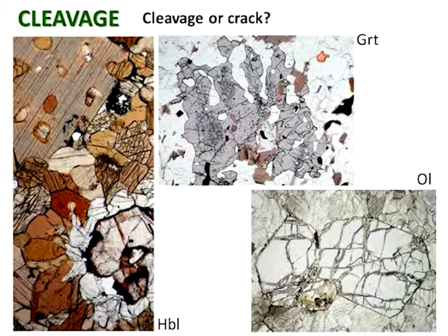So, the reason we know there are only cracks in here is that garnet very rarely, if ever, shows cleavage. So you only ever really see cracks. It's a bit like olivine. There's no visible cleavage in garnet, and so you do tend to see just cracks running across the crystal. And you've also got some areas of inclusions here as well, the sort of dusky inclusions.